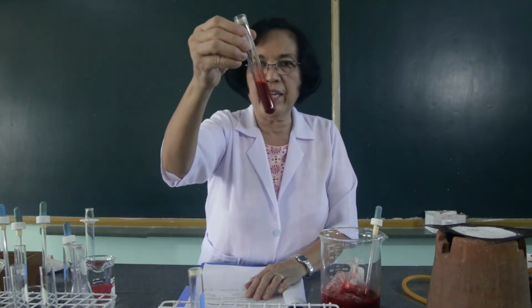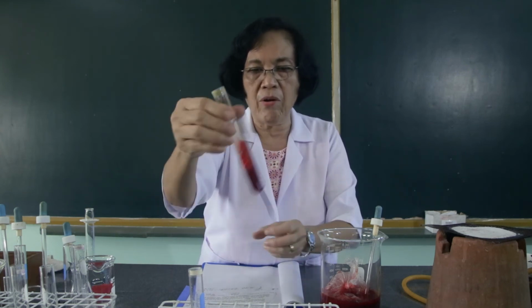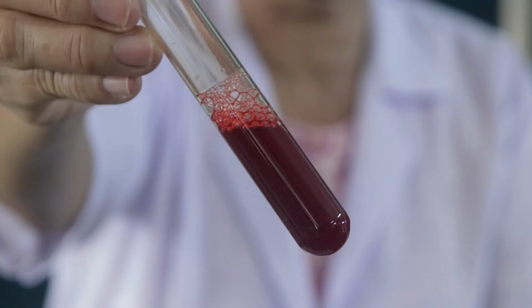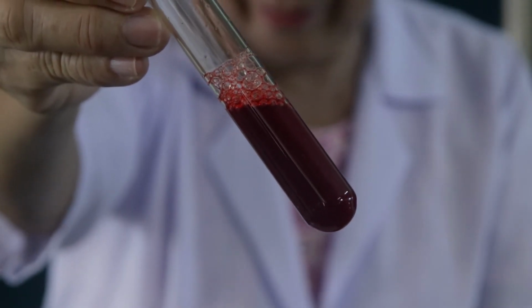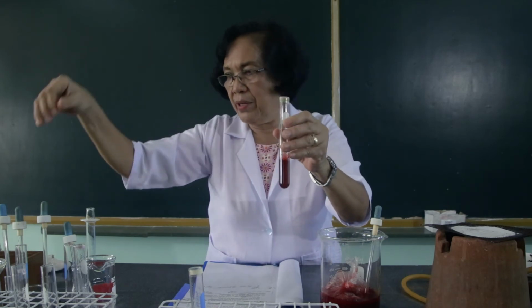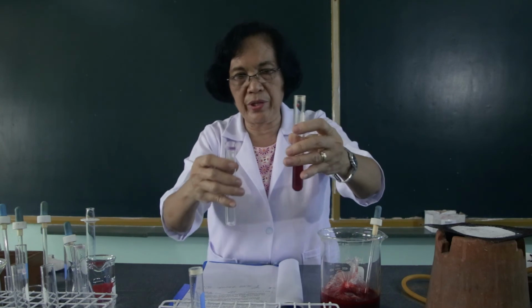We're going to shake this in order to aerate the mixture, meaning we're going to allow the air to get in. And I want you to observe what's the color of the blood. Then let us divide this into 2 so that the other part will be submitted to the reduced hemoglobin.